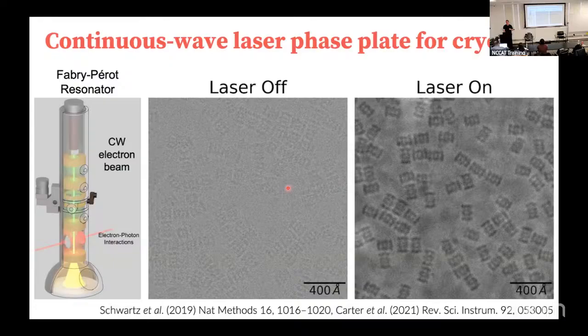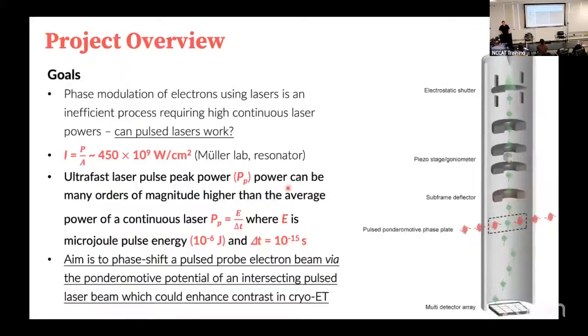And so if you were able to deflect the beam by 90 degrees, or change the beam phase by 90 degrees, you can in fact move that CTF from 0 to being an exponentially decaying cosine wave. So now it starts at 1 at 0, and then exponentially decays like that. So this is the principle of this 90-degree number that we all are striving to hit. And this is not the first time that this has really been achieved experimentally.